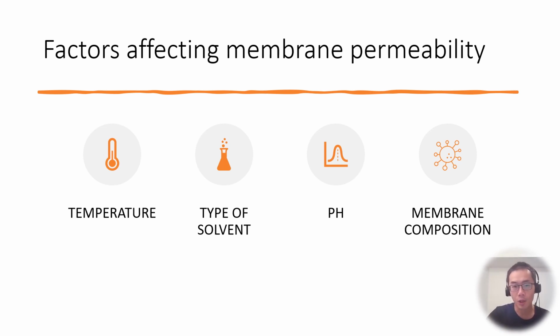So we are not going to be able to test all these things in our experiment. We are only going to be testing the effects of temperature on membrane permeability.